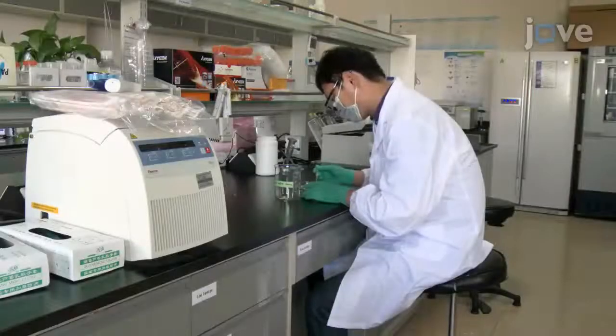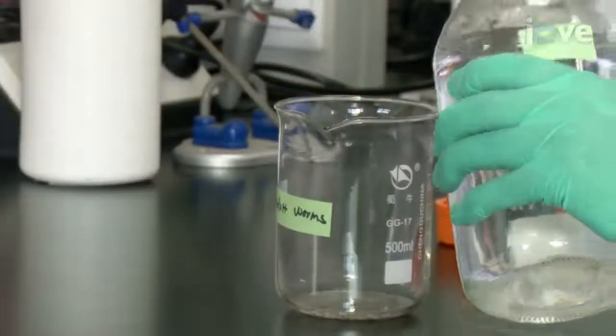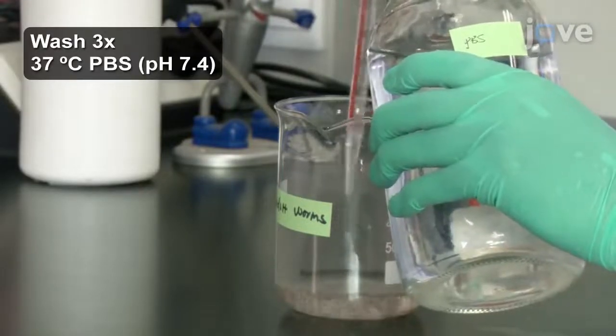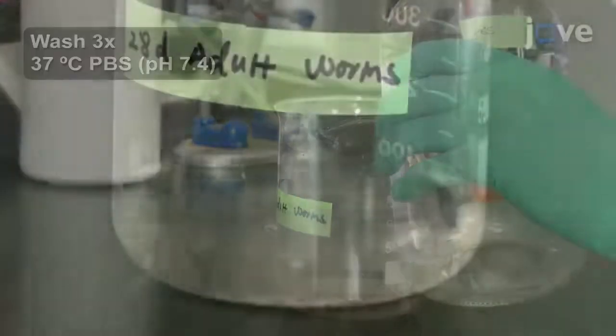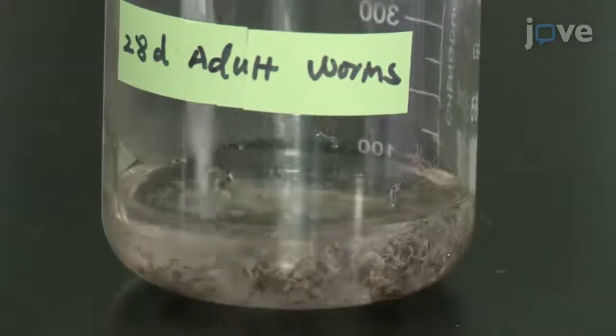Collect the parasites in a 500 mL beaker and wash them thoroughly but gently three times using 200 mL of warm PBS. Keep the washes brief and use gravity sedimentation to separate the parasites.